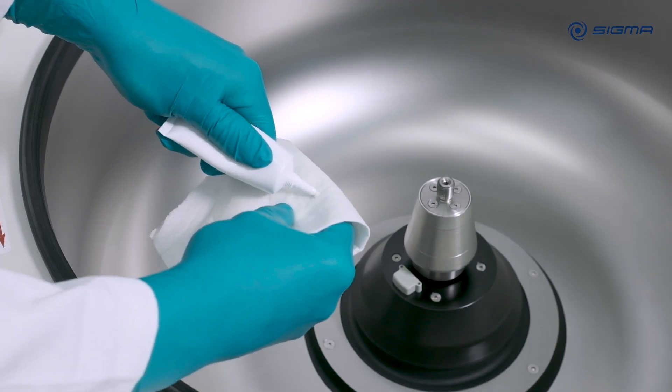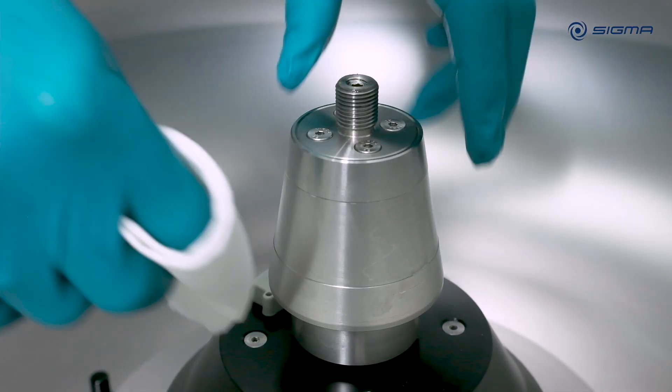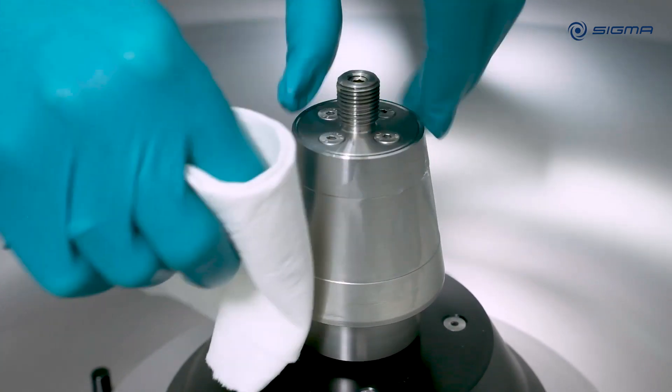To ensure smooth rotor exchange at all times, lightly grease the motor shaft with a small amount of pin grease, applied with a cloth.